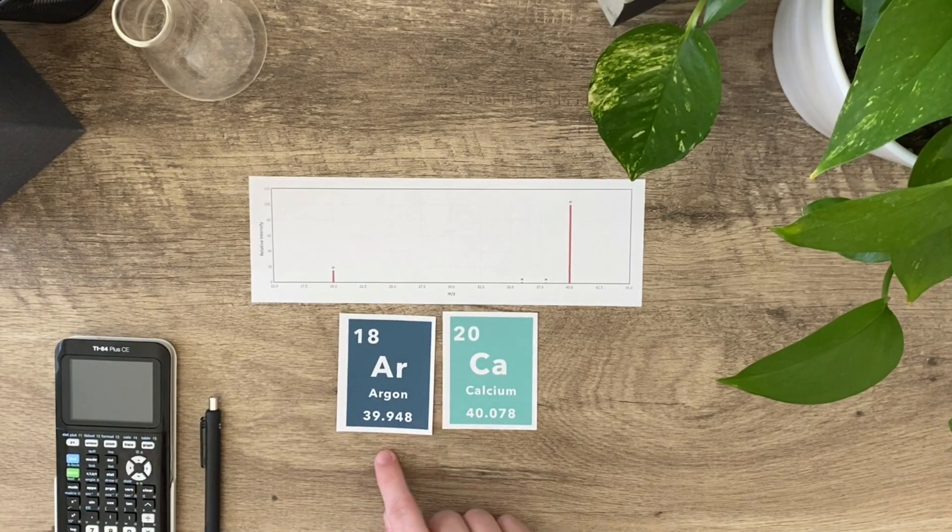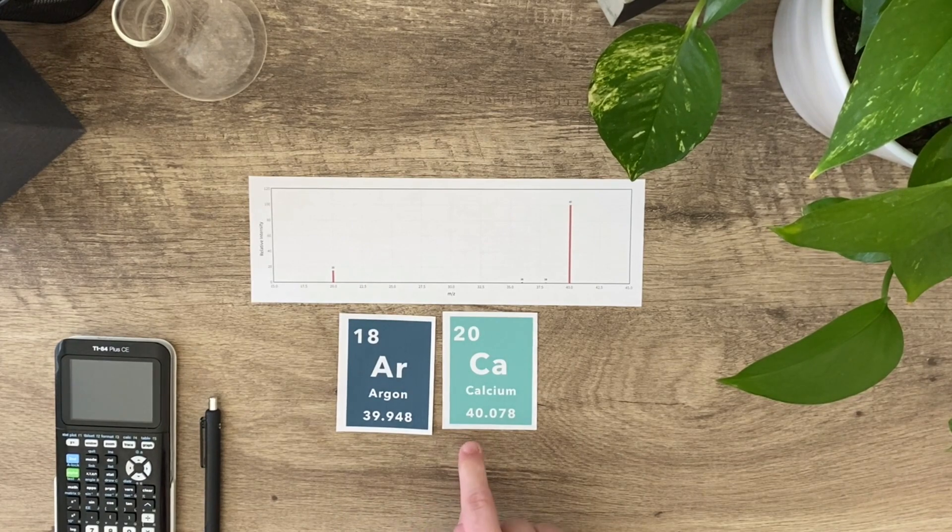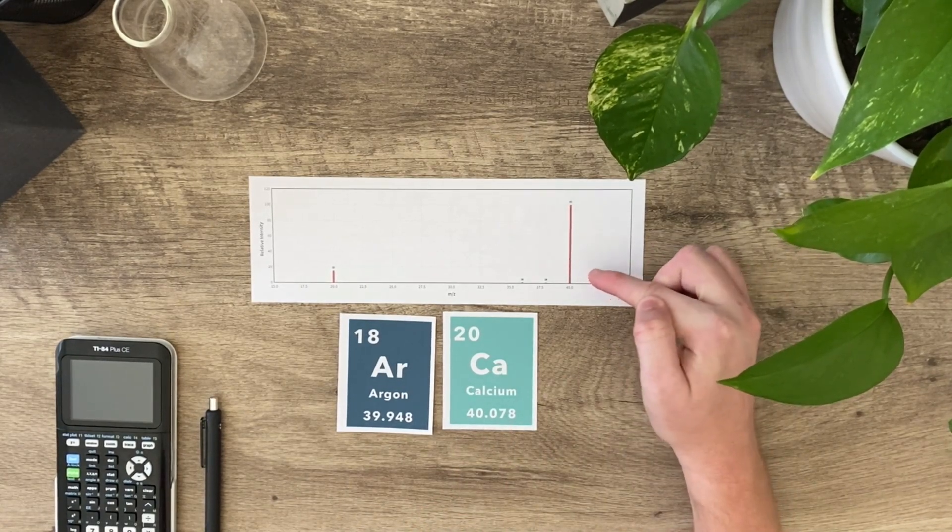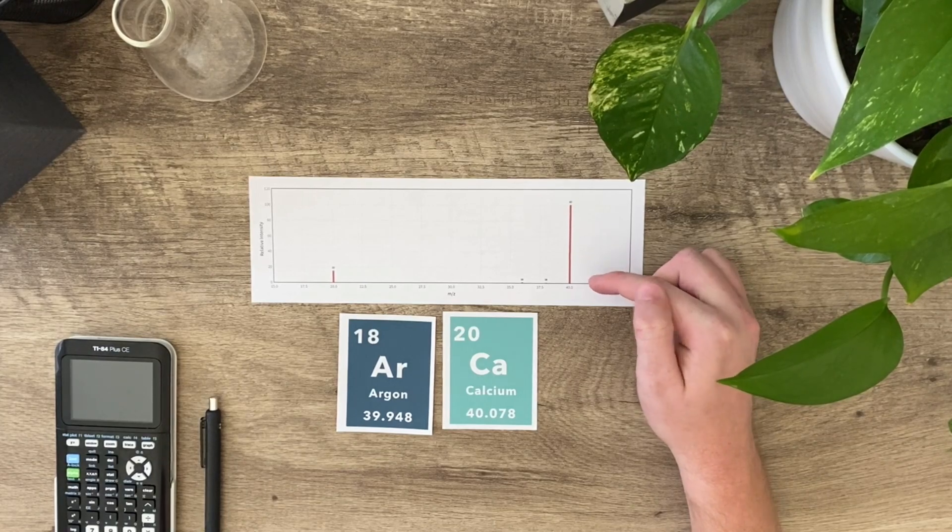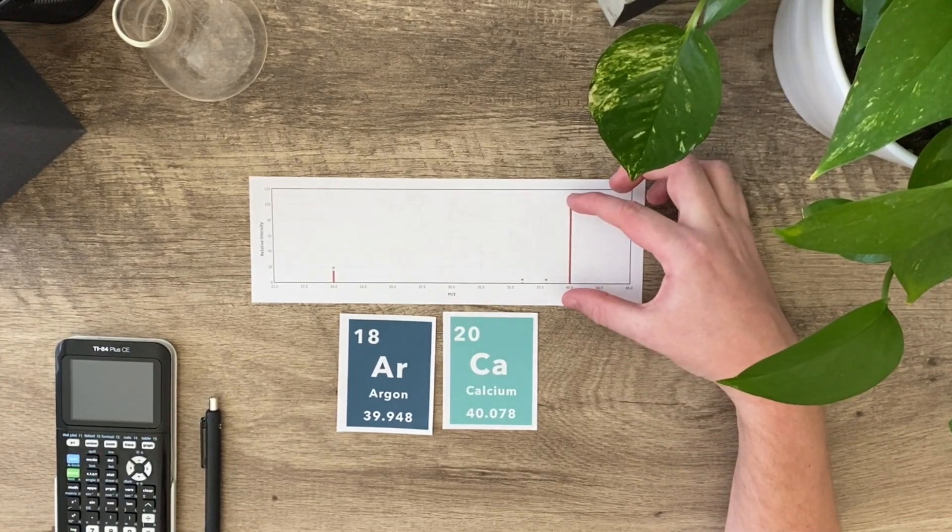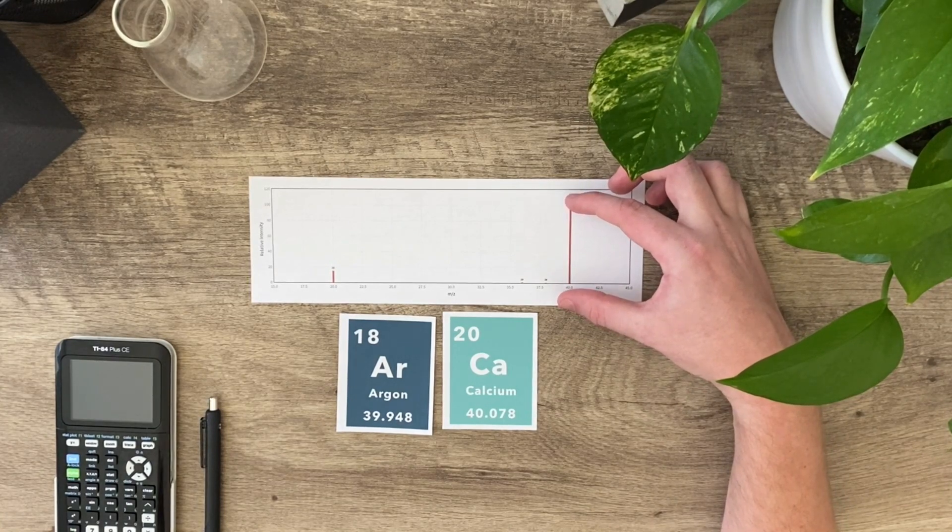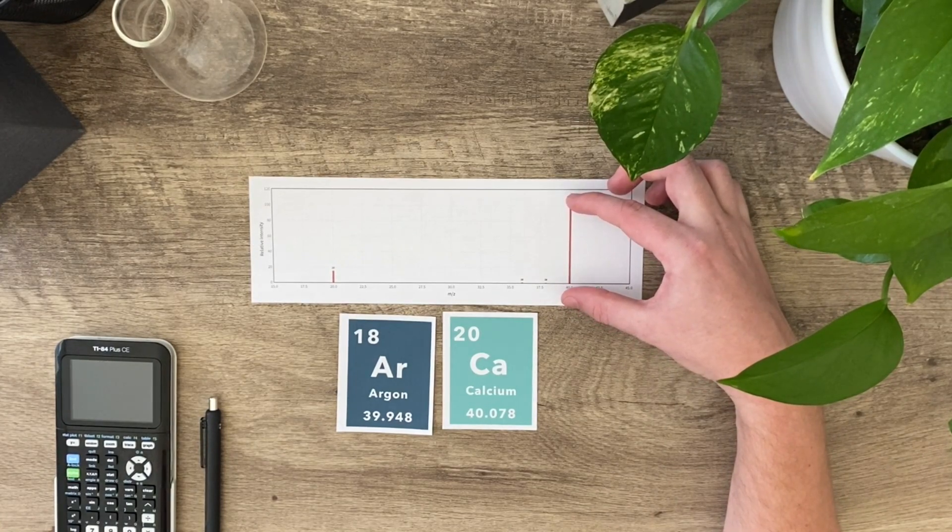Calcium and argon are a little trickier because they're only deviating by a tenth. I've got 40 and I've got 39.9. How do I know if it's calcium versus argon? The question is based on the intensity. Most of it is at 40, so I'm assuming that the intensity is exactly 40.